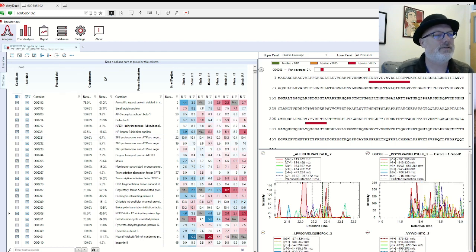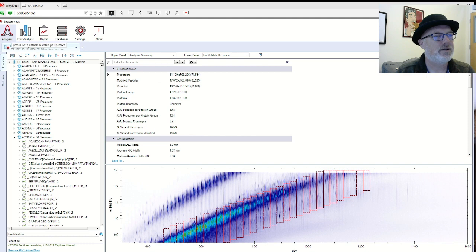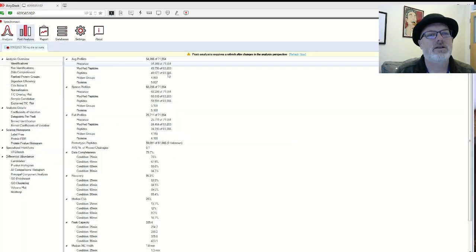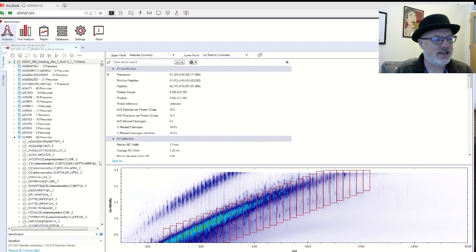All right, so we have 20 minutes left. I'm probably not going to make it through the whole video, but let's go briefly through the post-analysis view. Okay, post-analysis requires a refresh. So let's refresh it. All right, if it says this, just give it some time. And you can go back to the analysis thing to see what it's doing.